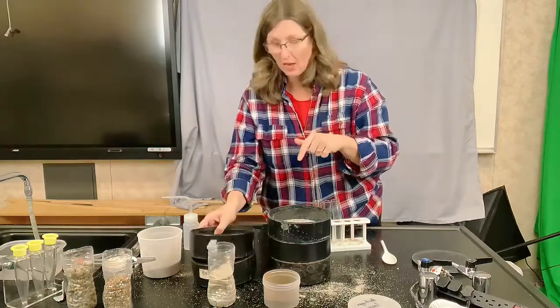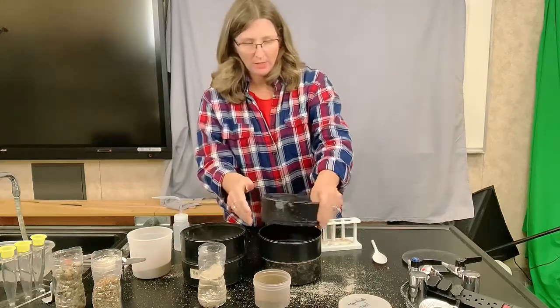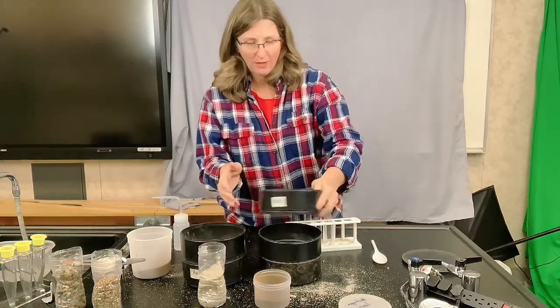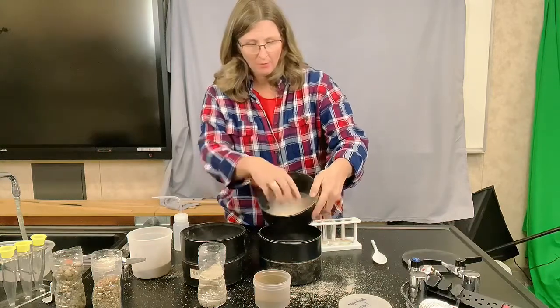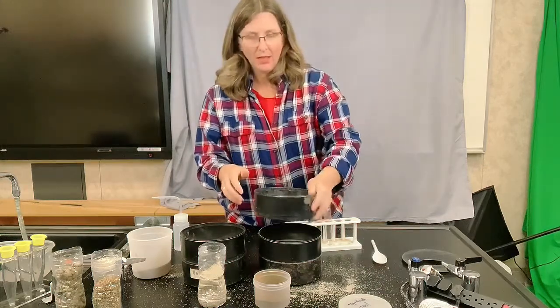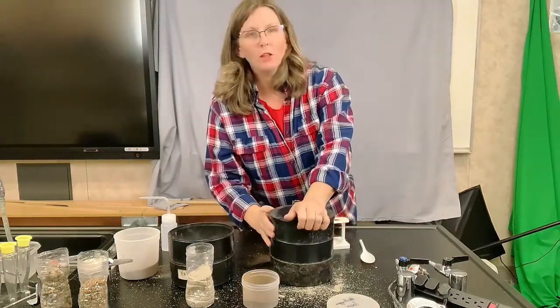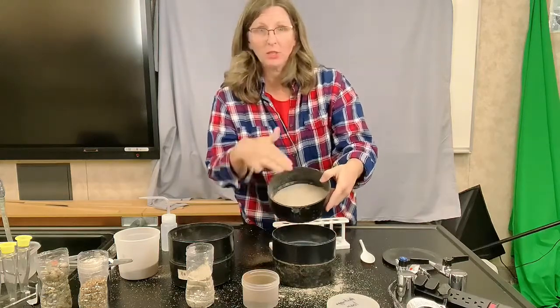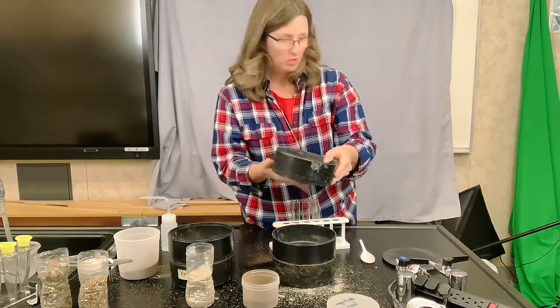Then we get to now what we start talking about in our soils for agriculture and construction. This is sand, and this is becoming a coarse sand, really. And the more we shake it, we can get more out. I'm going to show you the second layer. But this is a lot of sand. It's actually from our volleyball courts out at campus, and that's a nice coarse sand. What a geologist would then do is they would measure by weight each layer of sediment, and then they could tell you by weight the different compositions in your soil.